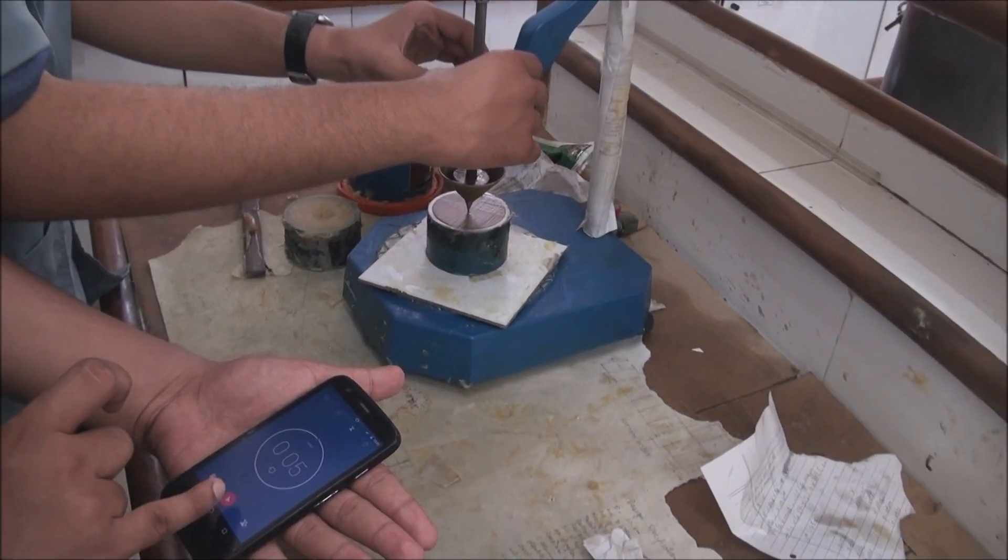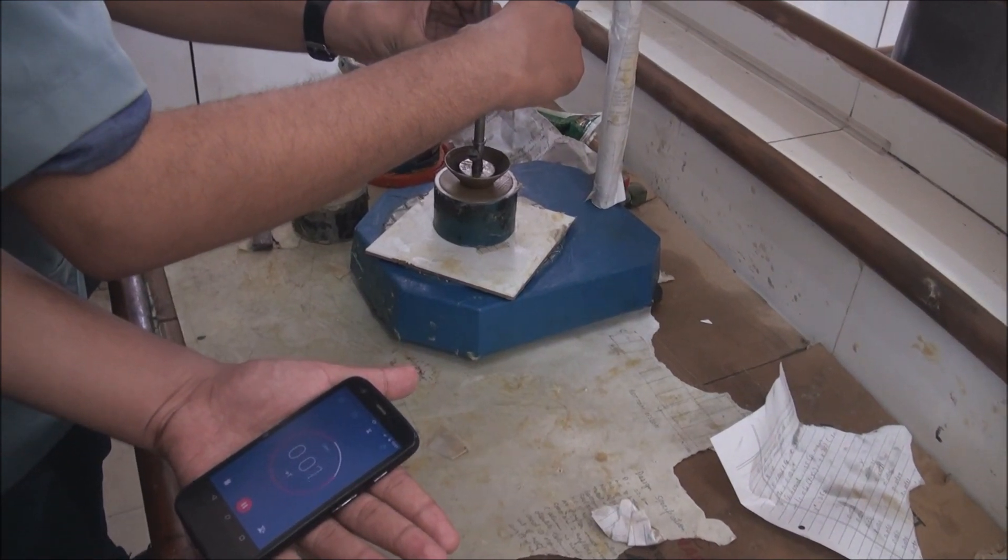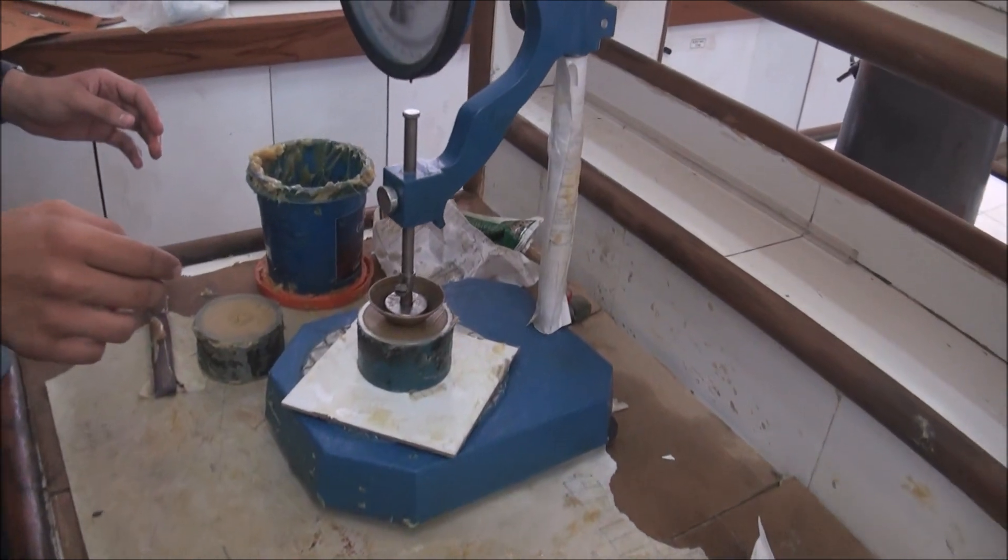Now set the timer on the stopwatch to 5 seconds and press the button till the timer runs out. After timer stops, release the button and adjust the needle with the rod containing the cone.